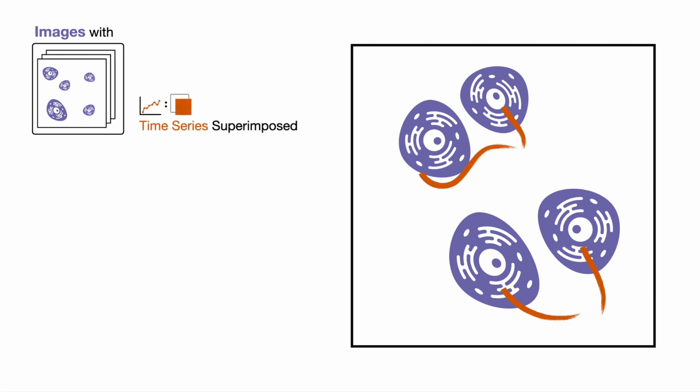The final composite visualization uses images as the primary data type. Showing the images directly helps reveal the spatial relationships between cells. Cell positions over time are superimposed directly in this coordinate space. Cell relationships are shown with a node link representation. Leaf nodes coincide with the cells in the image, and internal nodes represent cell ancestors.